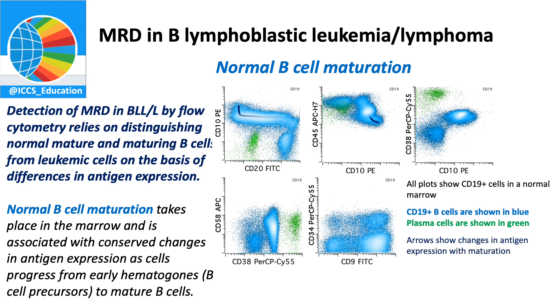On these different plots we have a number of antigens on the y and x-axis that change in intensity with maturation as a cell progresses from a hematogone, an early B cell precursor, to a mature B cell. The arrows I'm about to show you will follow changes in antigen expression you might expect to see with B cell maturation. Under normal circumstances these patterns are very highly conserved from one patient to the next. Understanding these normal patterns will allow you to pick up a population that's different from normal — one that doesn't belong and may represent a neoplastic or leukemic population.